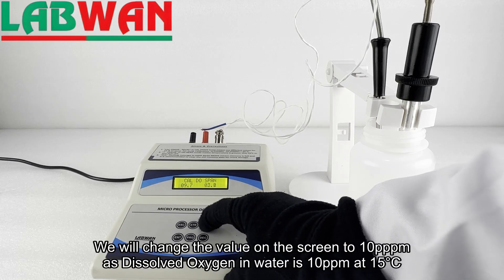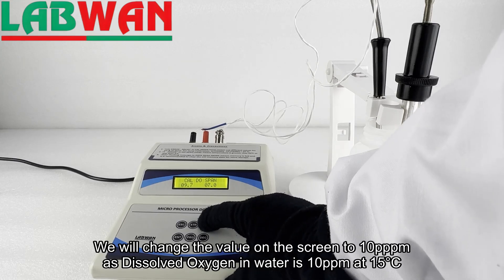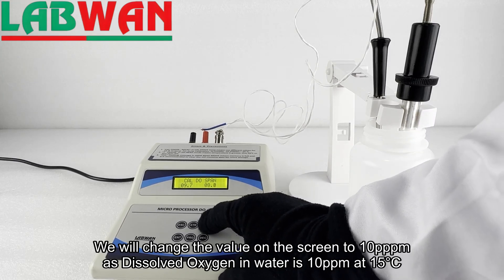We will change the value on the screen to 10 parts per million, as dissolved oxygen in water is 10 parts per million at 15 degrees Celsius.